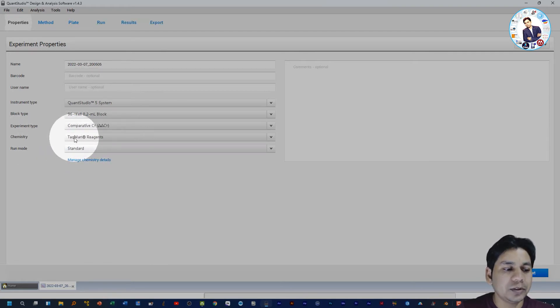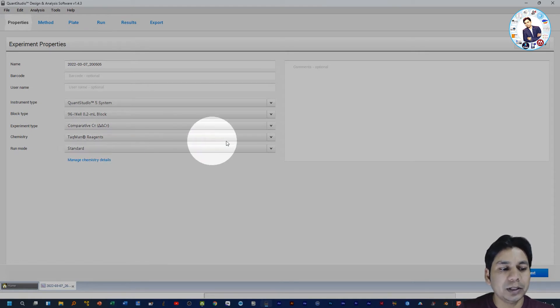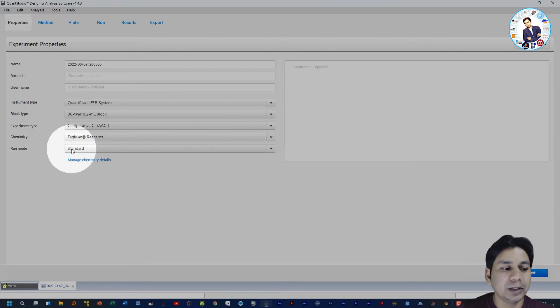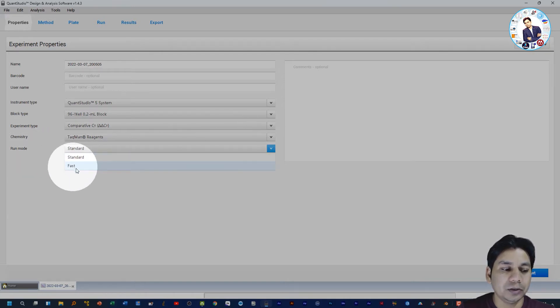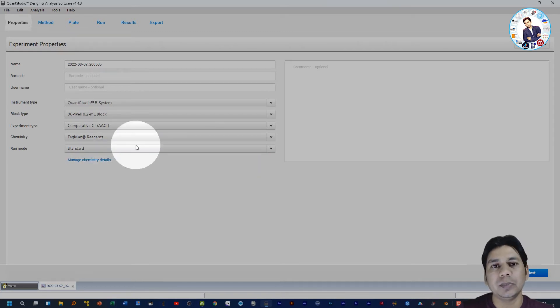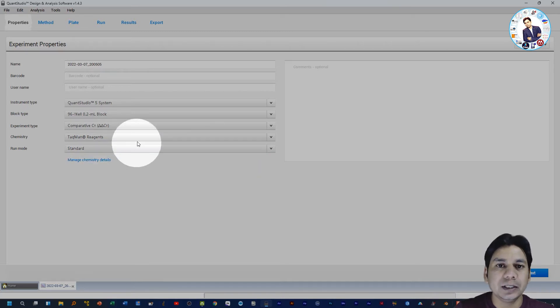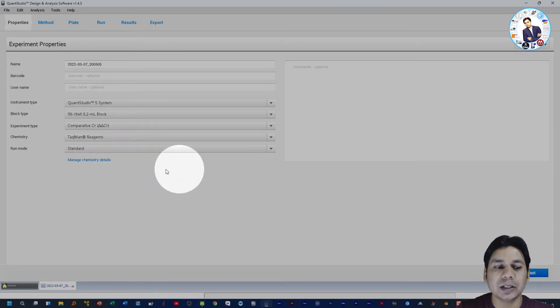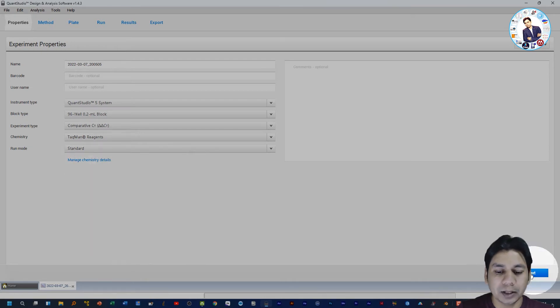Today I am showing the setup for the Comparative Delta Delta CT method, so I am selecting this. For Chemistry, I am selecting the TaqMan reagent, but you can change it from here. For Run Method, it is Standard by default, but if you want to use the Fast run method you can change it. Note that the Fast method uses different reagents, so select it only if you have the appropriate reagents.